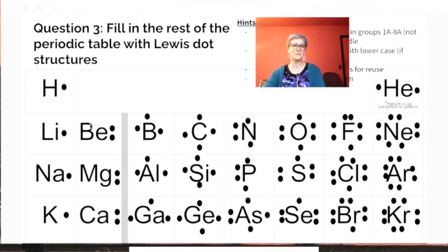And whenever I do this demonstration that you're about to see in this video, you'll see me do lithium, carbon, aluminum, and sodium. And thinking about what's going on, we've got some metals reacting with water, we've got some non-metals maybe reacting with water. So think about these things as you continue to watch the demonstration.